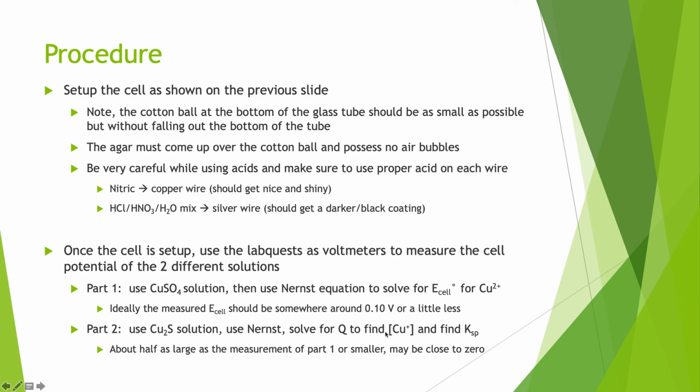And again, the measurements that you'll be making for both of these parts, once you have the setup done, will be really fast. But it will take a little bit to go through some of these calculations. I think the lab manual does a pretty good job of walking you through a lot of those calculations step by step. Waste-wise, all the waste for these 2 solutions will be collected, so do expect to see a waste container picking up the waste of those solutions. Otherwise, safety-wise, the big things are just the acids, and that's pretty much it for this week's lab.